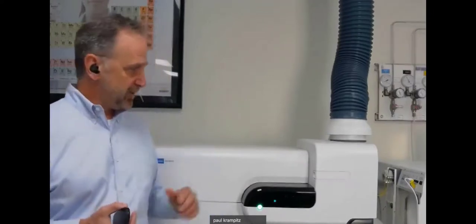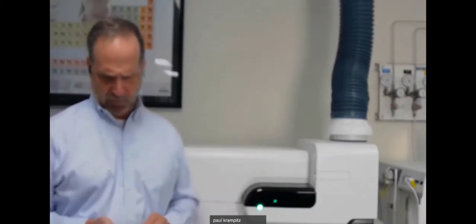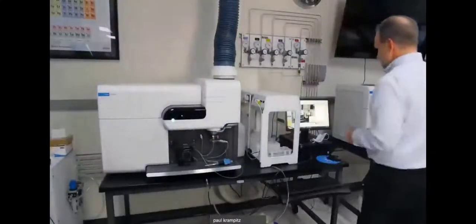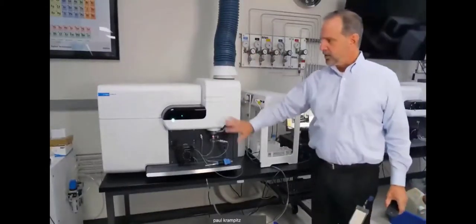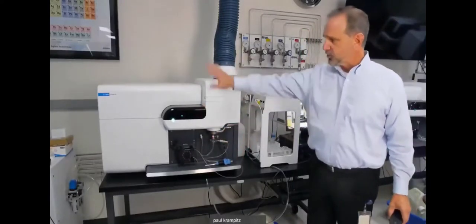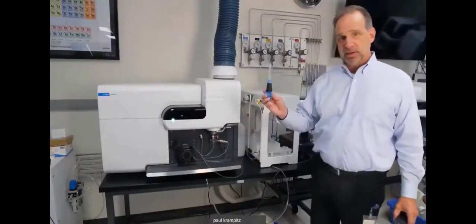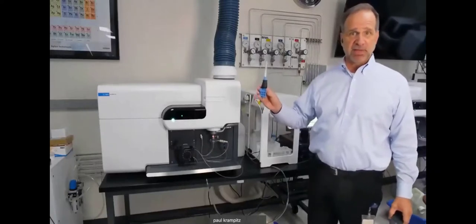And as you can see right now, this is the MP. I'm going to go ahead and switch over to another view for you so that you can see a little bit better view of the instrument itself right here. I'll give you a view a little bit later that will show you a close-up of the plasma, but this is your MP unit. This is your actual torch for your MP. You'll notice that it looks like an ICP torch, but it's a lot smaller.